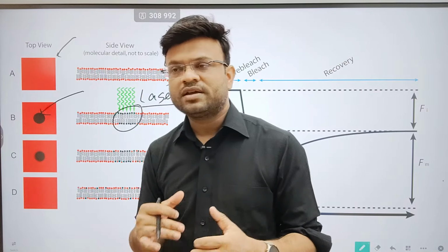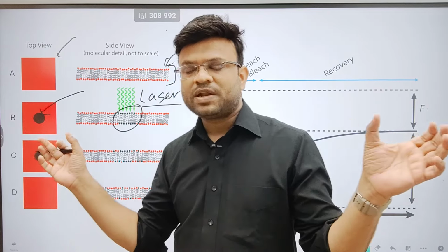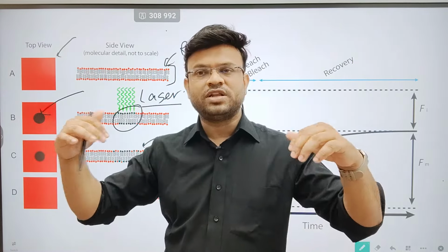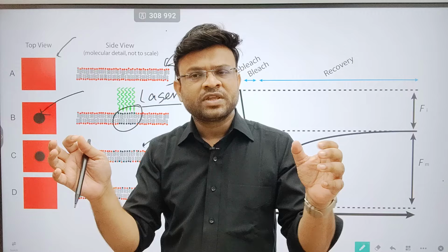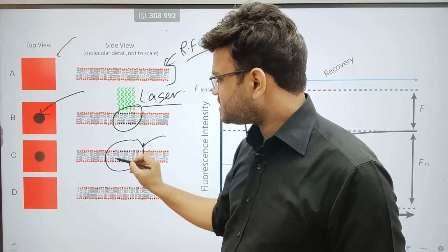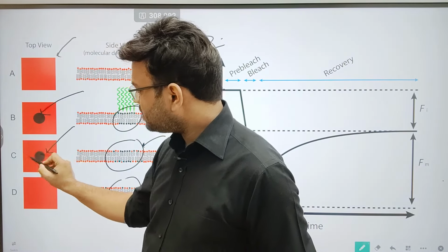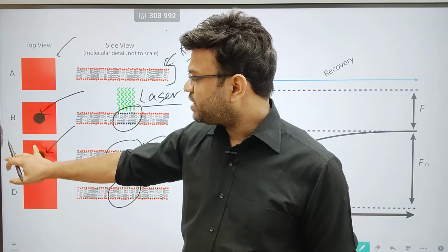Now, as I have said, as time progresses gradually, you would see that the plasma membrane would show fluorescence recovery. That means the phospholipids from nearby regions will be moving, and the phospholipids that have lost the fluorescence would also be moving. So gradually you will see a mixing over here. Initially you would see a mixing that has started, and after some time you will see almost complete mixing. So over here you can see that this black colored region, this bleached region, has started to become normal.